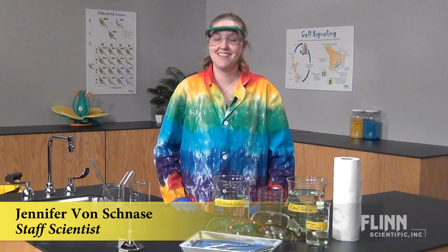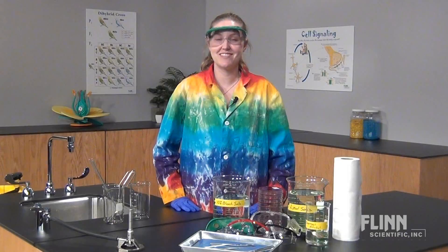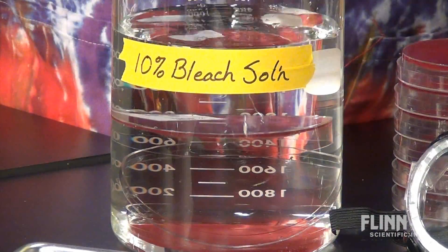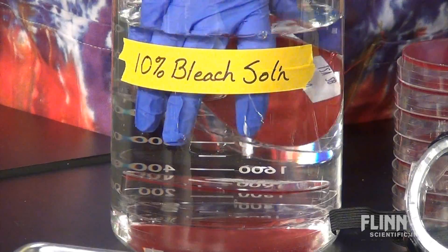The end of the school year is an exciting time for teachers and students, but before you leave for the summer, make sure to sanitize your lab. Start with your microbiology materials — any culture plates left over from the year should be addressed first.